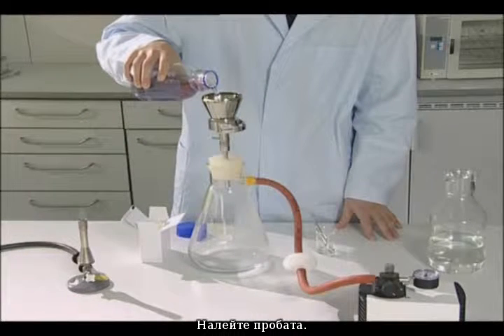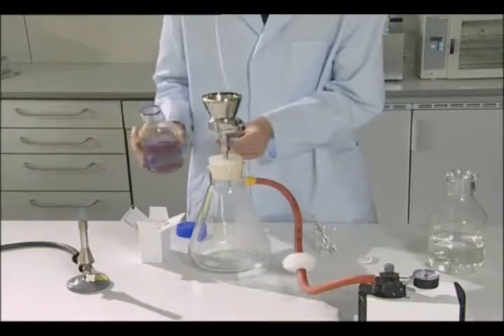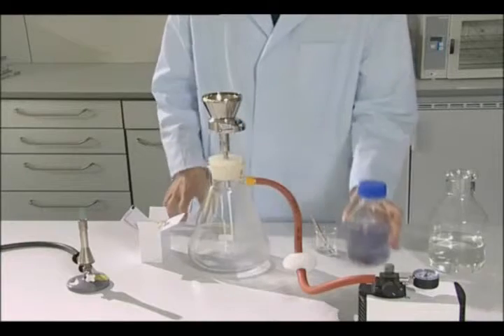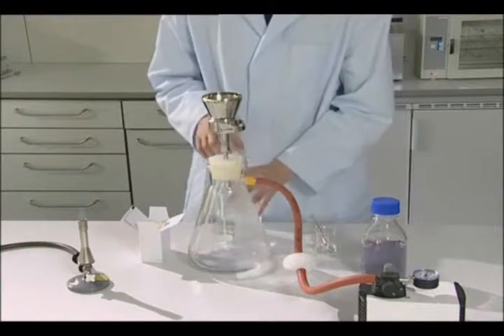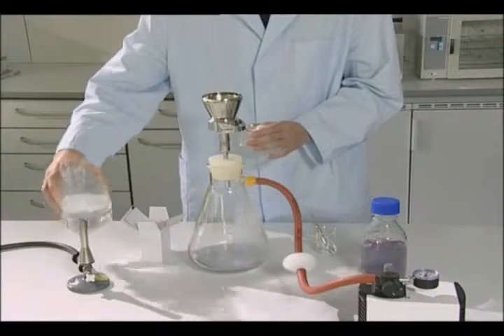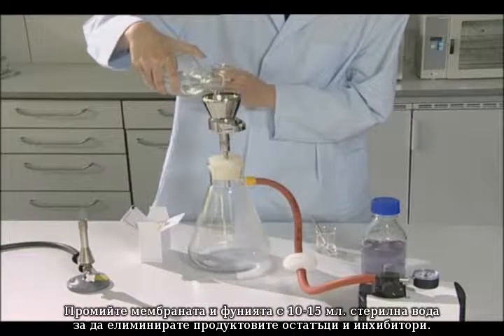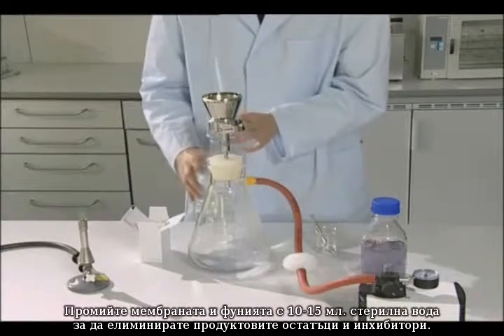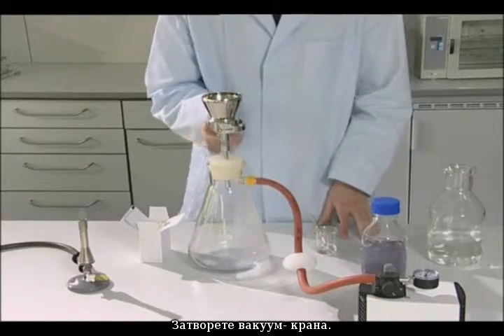Pour in the sample. Open the vacuum tap and filter the sample. Rinse the funnel and membrane with 10 to 50 milliliters of sterile water to eliminate product residues and inhibitors. Close the vacuum tap.